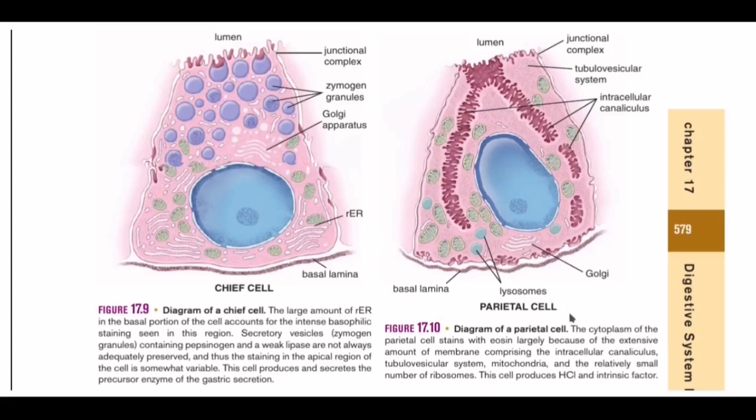So this is the parietal cell. The parietal cell is mainly eosinophilic in histological sections, due to the abundance of mitochondria here. Mitochondria, we need them for transport. Remember, we have our pumps which will pump protons into these intracellular canaliculi. The mitochondria here present this with eosinophilic presentation.